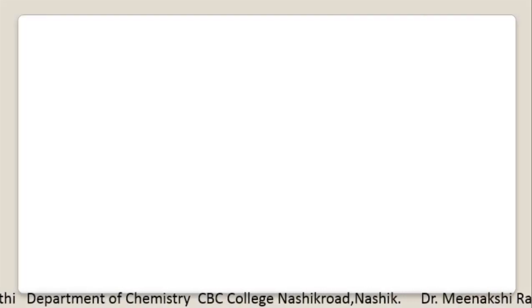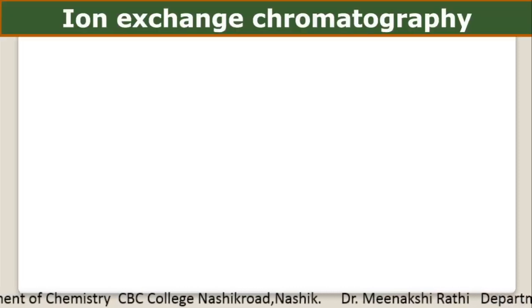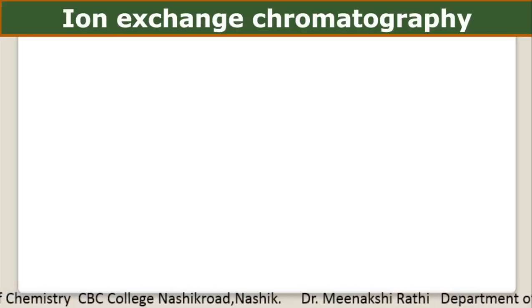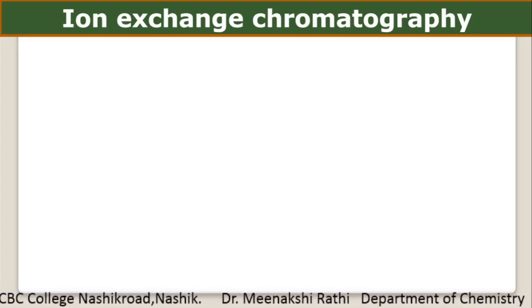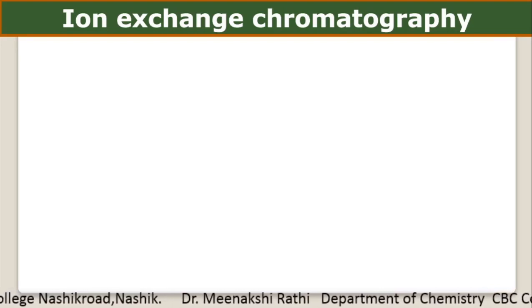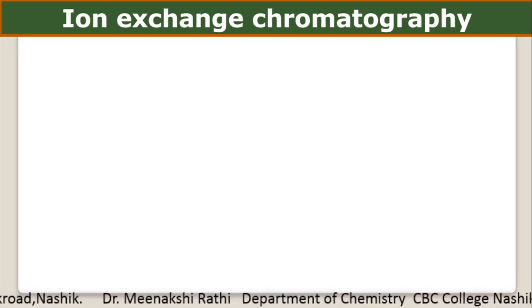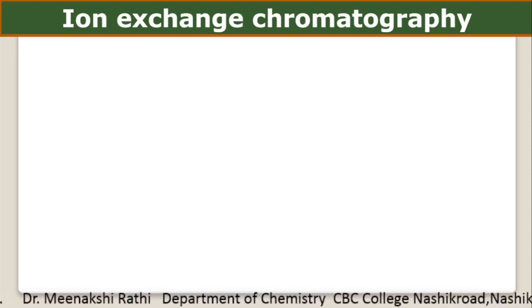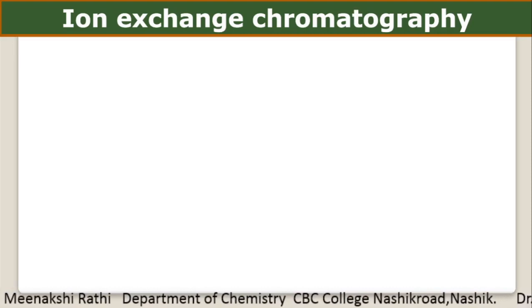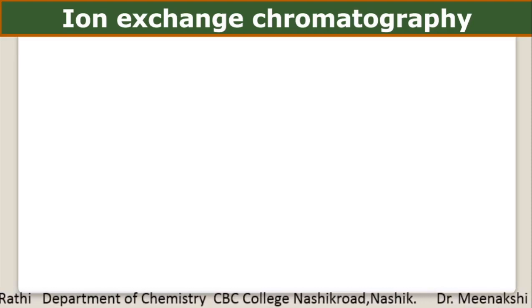Let's start with another chromatographic technique, and that is ion exchange chromatography. As per its name, there is an exchange of ions with similar charges. That means positive ions from the column are exchanged with positive ions of the mixture which we want to separate.